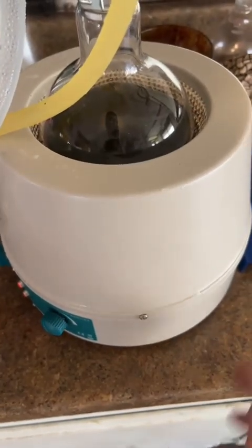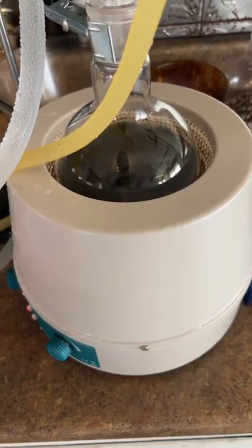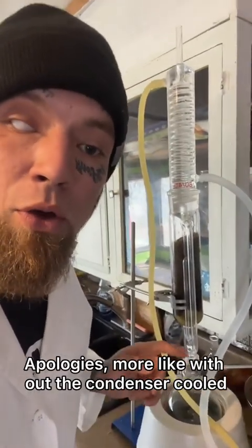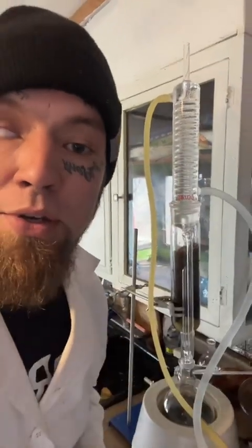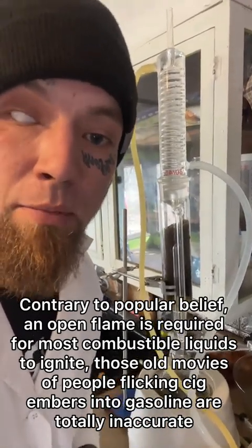Essentially, you have a heat mantle. I like to use an electric-producing heat mantle because an open flame is kind of risky whenever you're using flammable solvents. You have a water pump here that pumps ice-cold water up into what's called a condenser. Without this condenser, whenever this comes to a boil and starts to evaporate your solvent, it would run up and out the top, causing an eruption of flammable liquid — hence why an electric heat mantle rather than an open flame is worth its weight in gold.